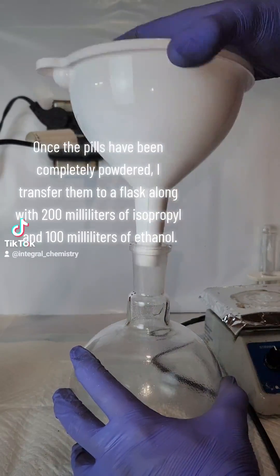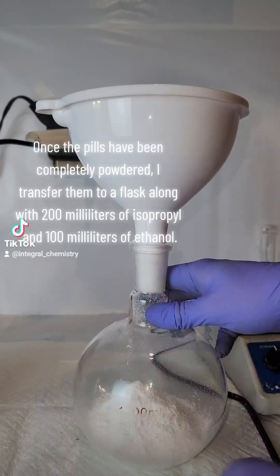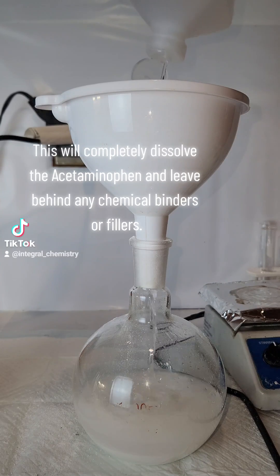Once the pills have been completely powdered, I transfer them to a flask along with 200 ml of isopropyl and 100 ml of ethanol. This will completely dissolve the acetaminophen and leave behind any chemical binders or fillers.